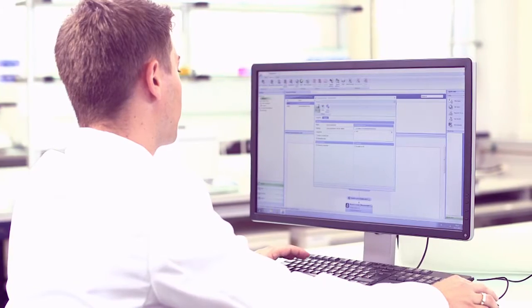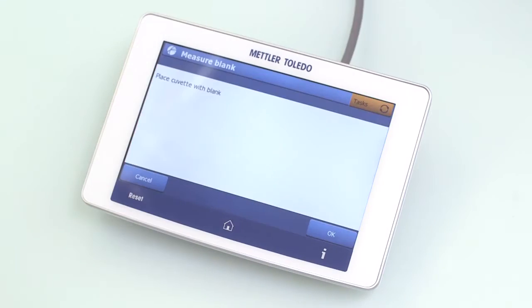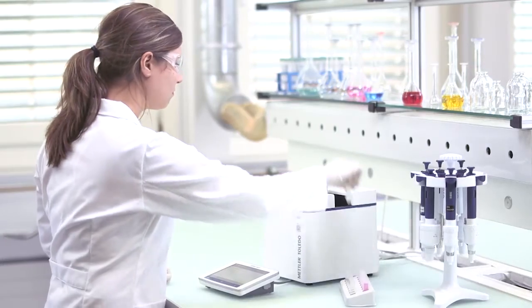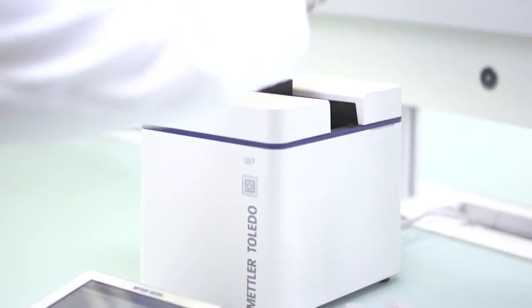At any time, LabX can provide a complete overview of the lab for the manager. Operators work entirely at the instrument and are guided through workflows with step-by-step instructions, guaranteeing adherence to SOP requirements.